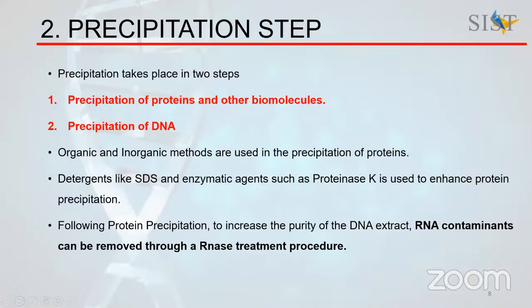Then the RNA contaminants, because we only need the DNA, not the RNA. The presence of RNA in the DNA extraction might disrupt the procedure, so we have to eliminate the RNA as well. In order to remove the RNA, we can add RNase enzyme, which will particularly remove the RNA. All right.